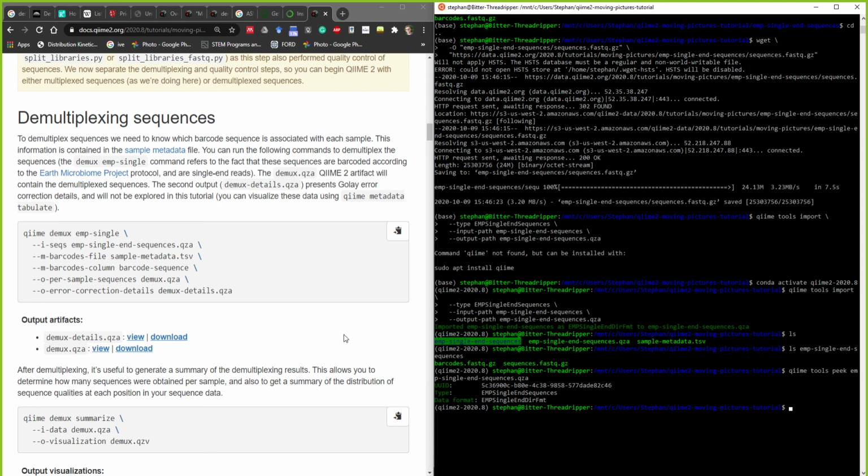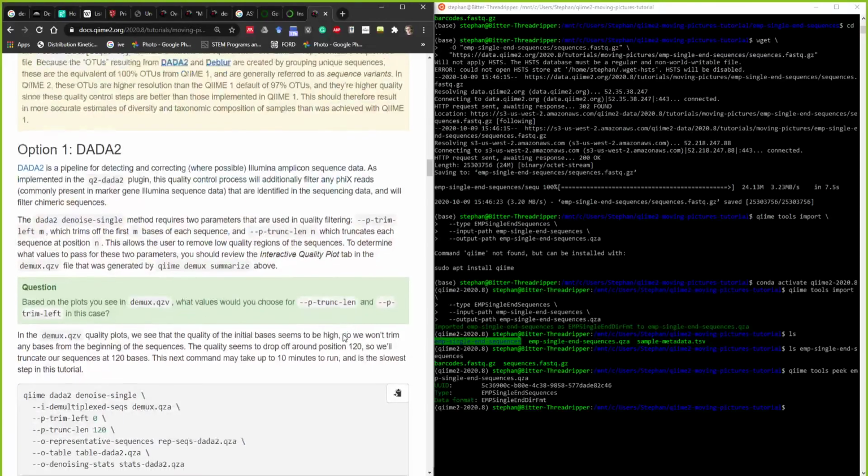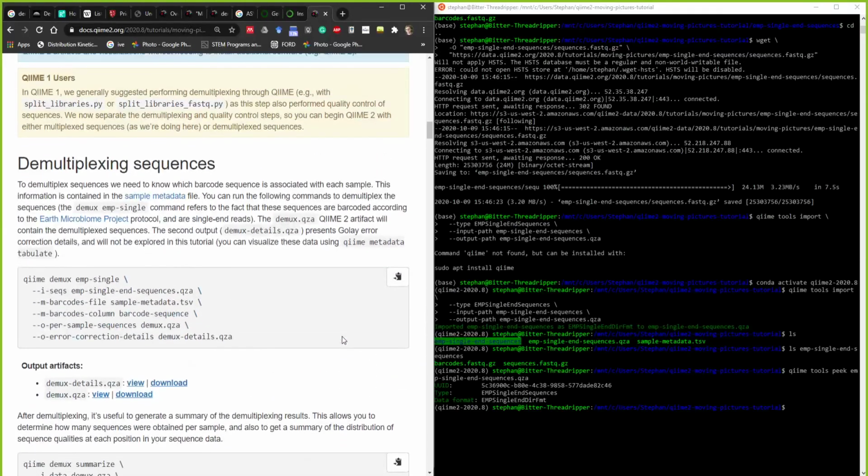And you guys, it is 4 o'clock. If you want, we can keep going through this step and get to the end. I think it's too much longer. Or we can at least finish the demultiplexing sequences bit, which is simply, for those of you for whom it is working, just go ahead and copy this and paste it in. Okay, and then Batia, we'll cover yours.